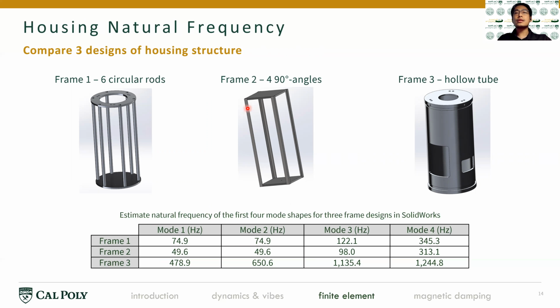And the second one is inspired by a CubeSat design, where you have these 90-degree angles at the 4 corners. And the third one is a solid hollow tube with some cutout windows to look into the stage and to operate the stage.